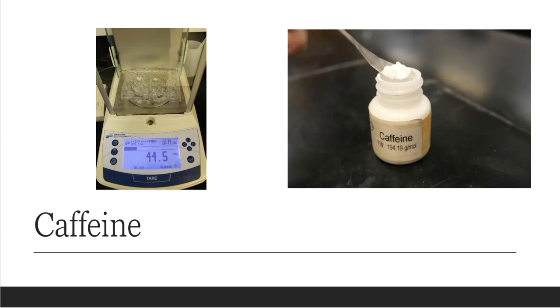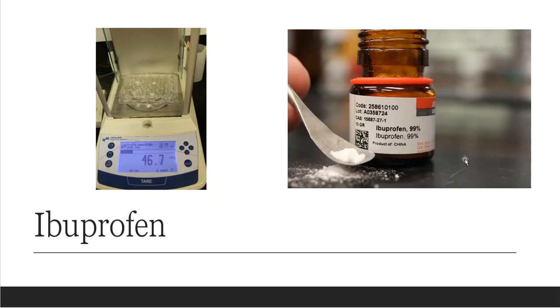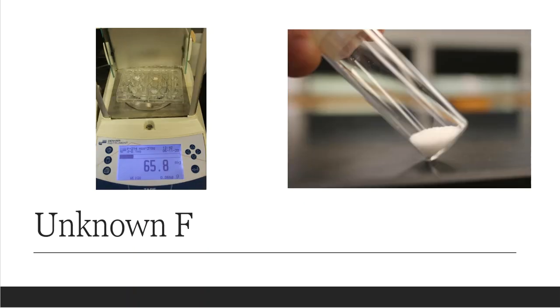I have enough for it to show up. And then my next one was ibuprofen, and oh, surprise, it's a white powder. And then I go back to this spot plate, and I weigh out 46.7 milligrams. And then finally, I go to my unknown. Well, if all of my knowns are white powders, it's not surprising that my unknown will be a white powder.